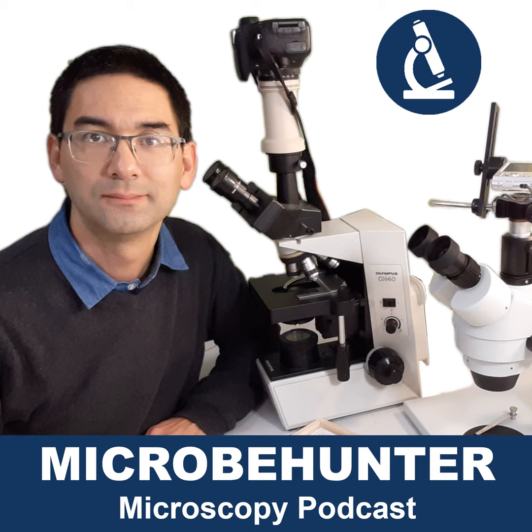Let's move down all the way to the next one. Not centering the slide is problem number 9. People usually drop the slide into the mechanical stage, if you have a microscope that has a mechanical stage, and they completely forget about centering the slide. And yes, I have seen students in some extreme cases that actually looked at the slide label. Of course, you're not able to see anything at all.